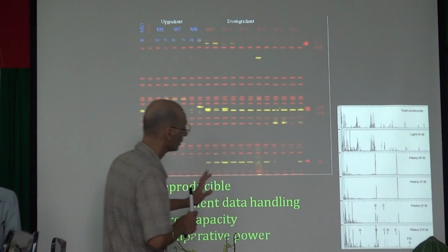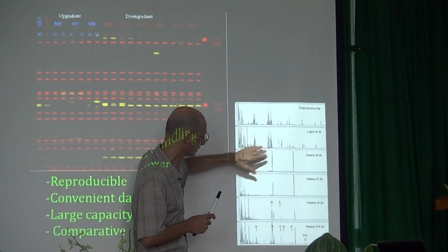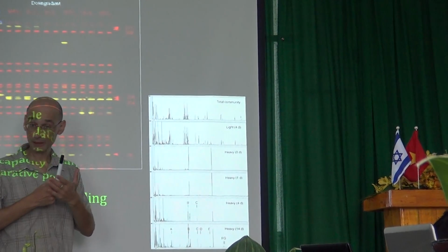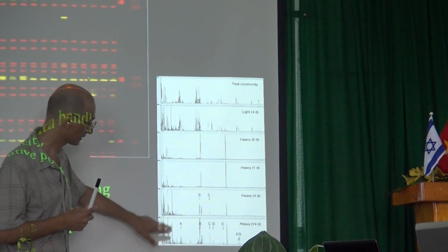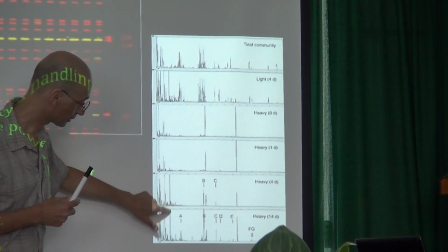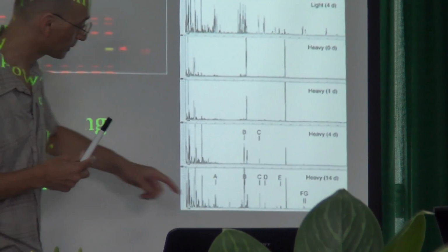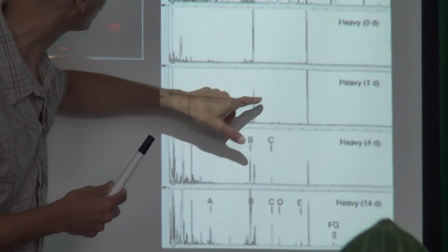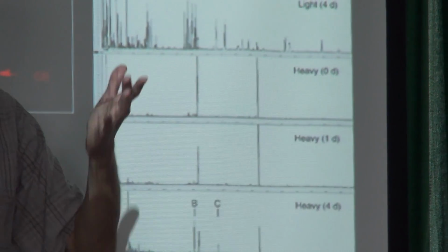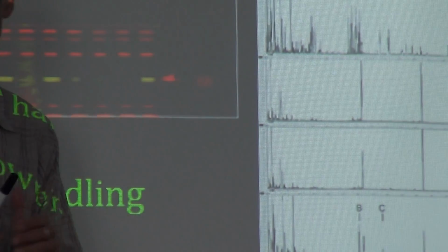Okay, so what you have here is that each block is a different sample, so you can rather easily compare between the samples. You can see where you have a peak, which would mean this bacterial population is in common between these two samples, and where you have a similar peak. For instance, let's say this one is found only in these two samples, and it's not found in the other samples. So you can compare the composition of your samples.